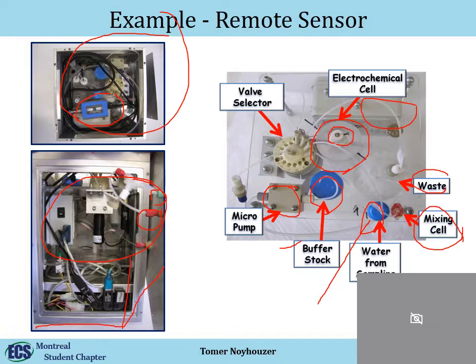And so when you design a system, you need to make sure that everything is covered. So the robot will send a command, you'll measure, and then it will transmit the data. But if you have a flow system, everything is programmable and you can make sure that everything runs well. And again, you don't have to touch it. And once your system runs okay, you can trust it and it will do its job.